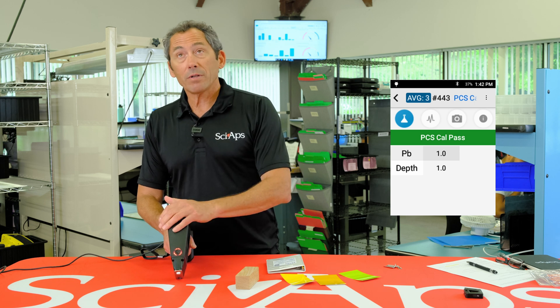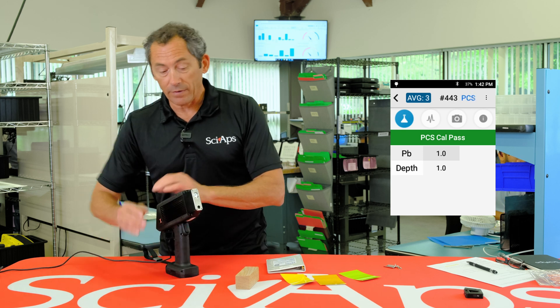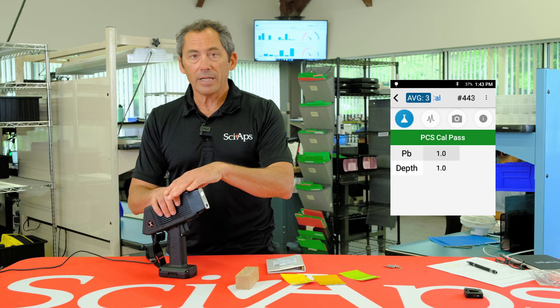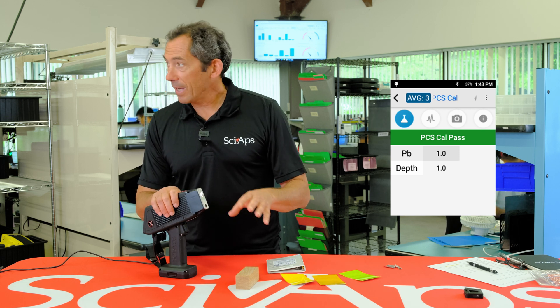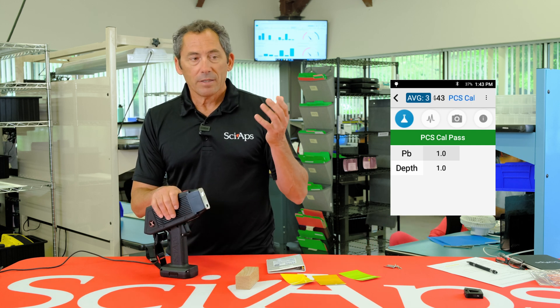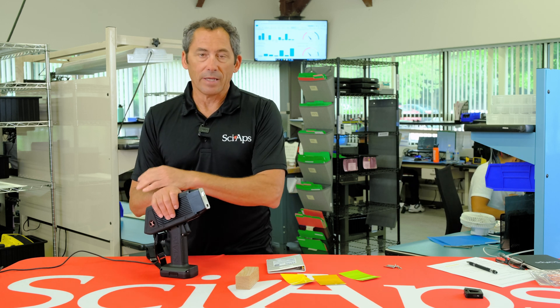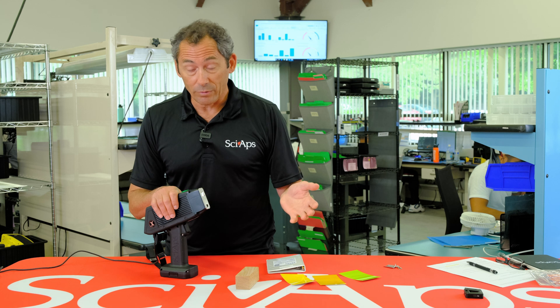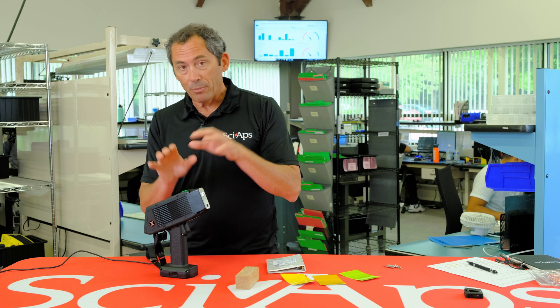So let's talk about how it works. What we've done is replaced the radioactive isotope. Instead of radioactive materials inside the gun decaying to produce radiation to measure lead in the paint, we've replaced all that with an x-ray tube. An x-ray tube uses high voltage and electric current to make x-rays — the same technology used in doctor's and dentist's offices. We've miniaturized it with our partner and put it in this device.